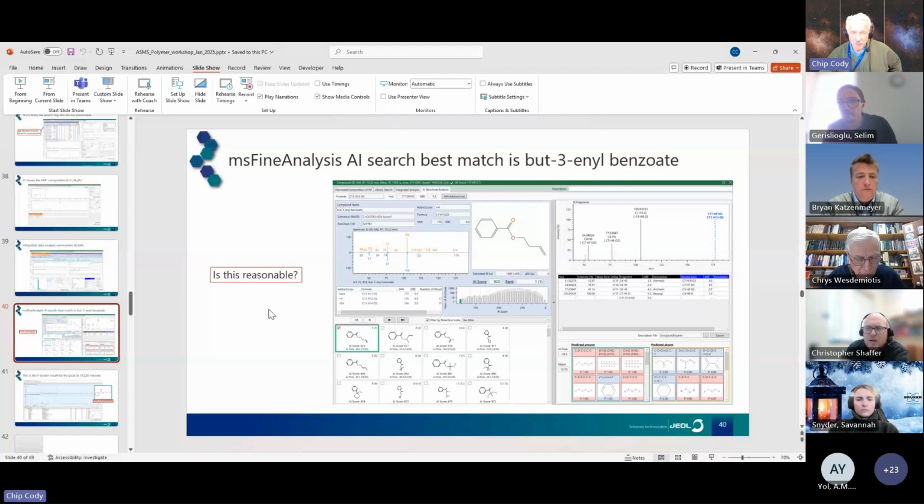The tolerance is much wider for calculated retention indices, although when I've compared things that we have reason to believe are correct, we're using the NIST algorithm for predicting. Okay, so then temperature gets factored into that too, I guess. Yeah, I presume so. The NIST algorithm is published. I didn't really look at it very closely, but that is limited to non-polar columns. There's no calculation for polar columns, so we're relying on experimental data in that case.